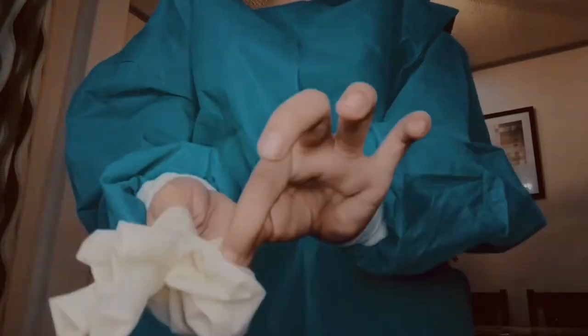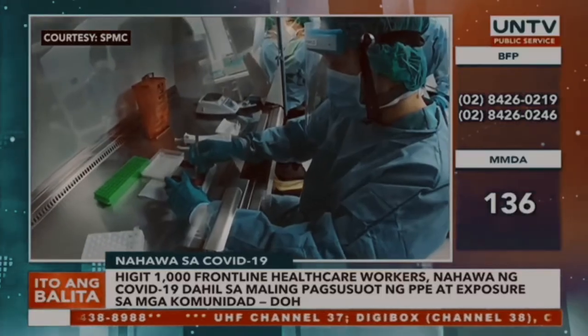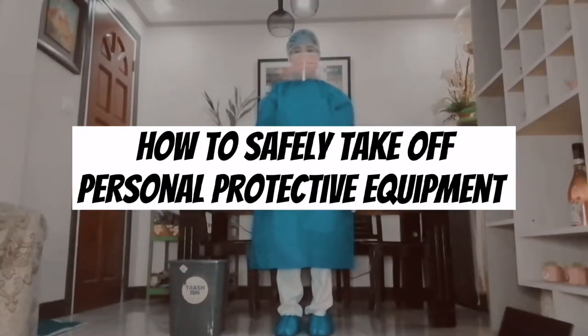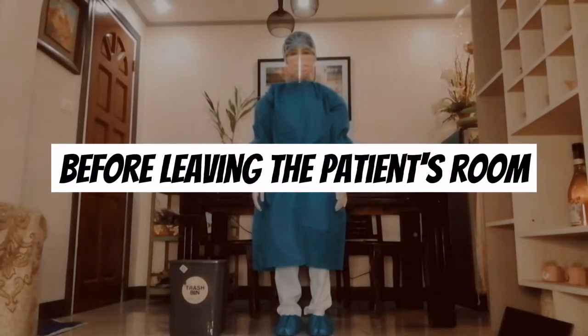Adhering to the correct procedure for donning and doffing of PPE up to the last part will ensure our safety as healthcare professionals, as well as keeping our patients safe, which is everyone's job. This is Doffing of PPE, the end game. How to safely take off personal protective equipment before leaving the patient's room.